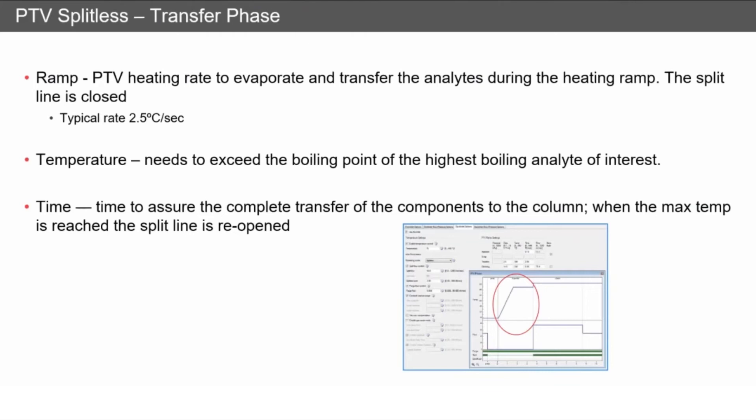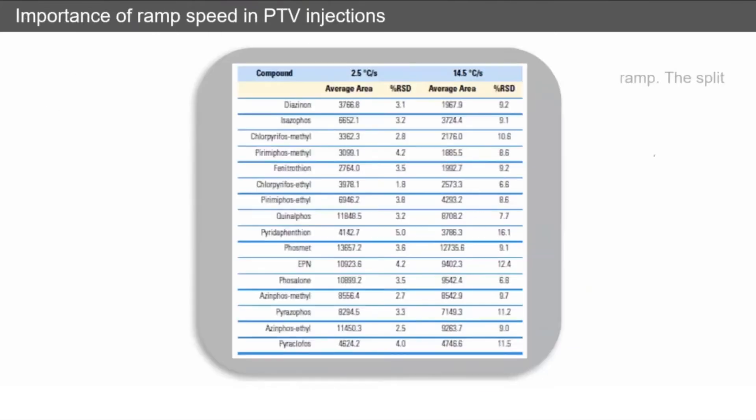Like I said, the ramp speed is really important. We've got a series of pesticides here. When we run a ramp speed of 2.5 degrees per second, we get really good RSDs, less than 4%. However, if we ramp this up too fast, we get much higher RSDs. This is due to irreproducible expansion of the solvent and you will lose some compounds via the split line because the solvent's just massively evaporating in an uncontrolled manner.